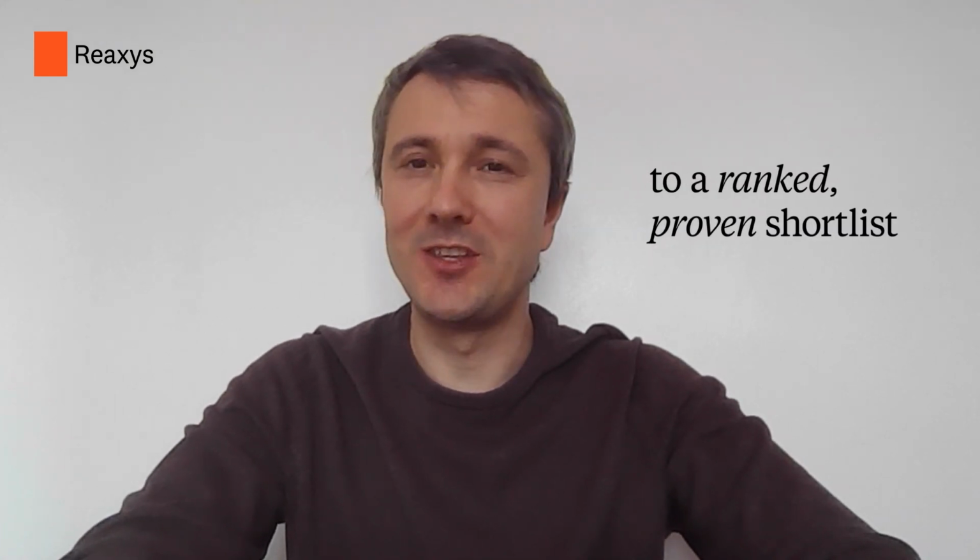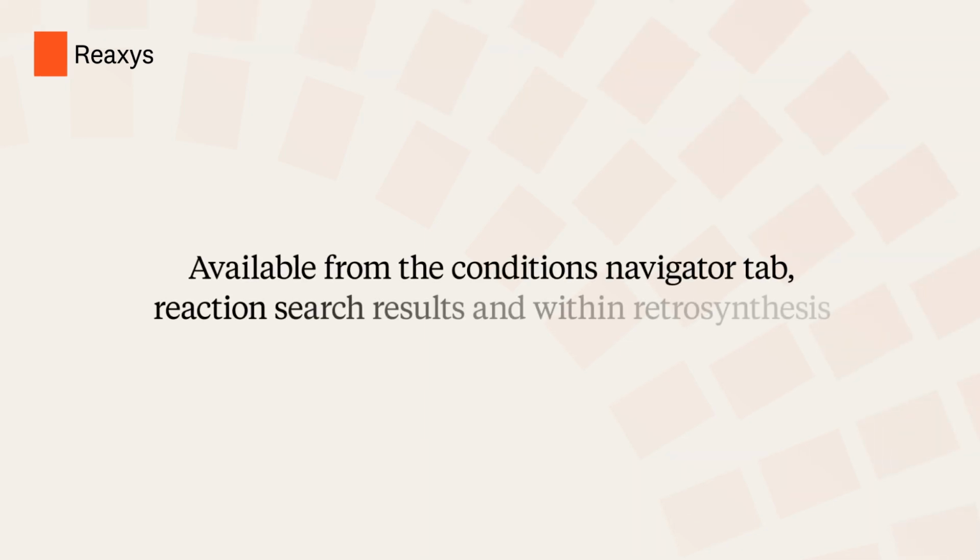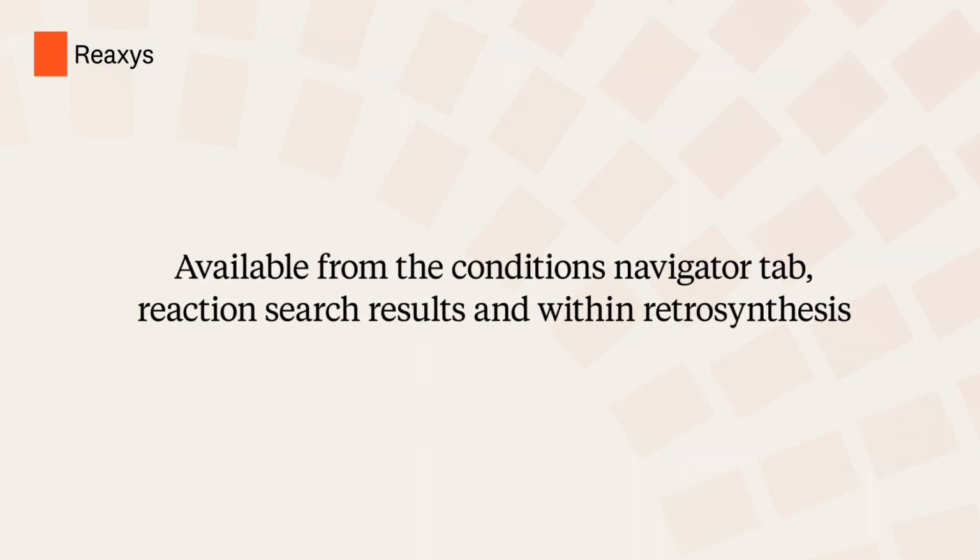A new tab in Reaxys you already know that turns "I'm not sure which condition to use" into a ranked, proven shortlist. Reaxys set the standard for planning chemistry, and this pushes it further.